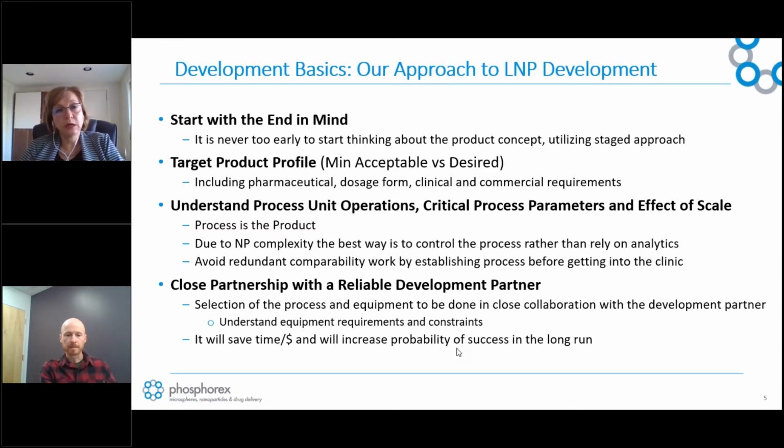The first one is to start with the end in mind. It's never too early to start thinking about the product concept. Of course, we're utilizing a stage approach. We're not planning on doing all the development activities, but at least have it in the back of your mind and use it as a paper exercise. A very important tool is to start working on the target product profile. And typically we'll lay out the one that is desired, but also the one that is minimally acceptable, and which includes pharmaceutical or dosage form TPP, but also clinical and commercial.